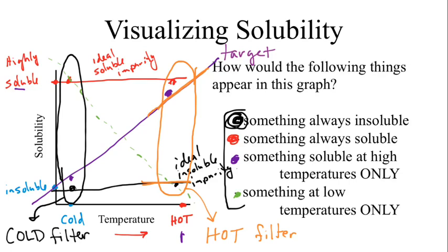Last summary, just to hopefully summarize everything. If we're going to look for our target compound, we want to find the ideal solvent. What do we hope to see? At cold temperatures, what do I expect? It better be insoluble, so I could filter it out.